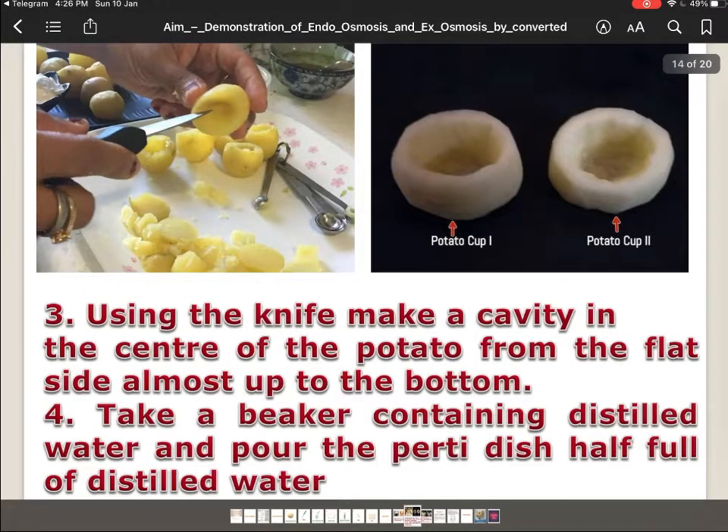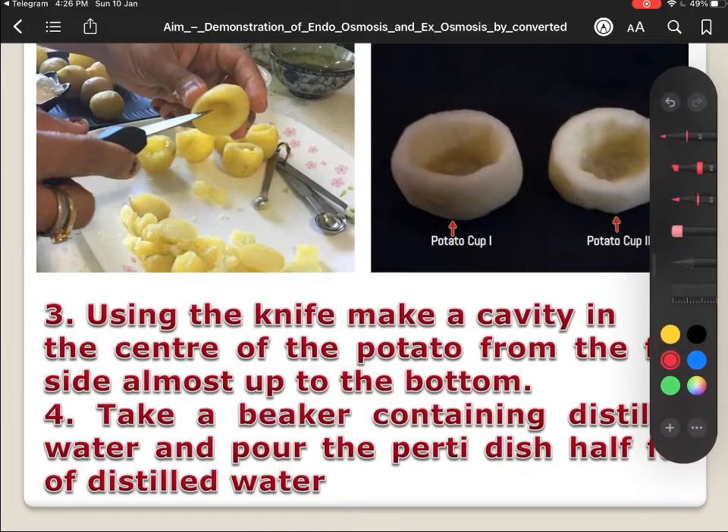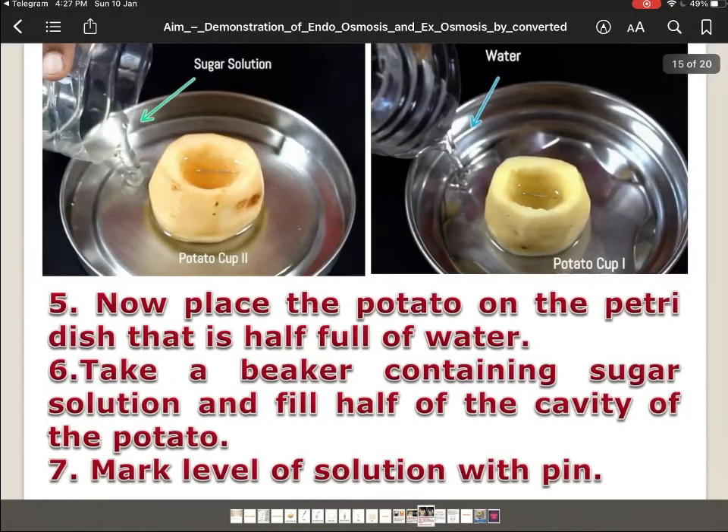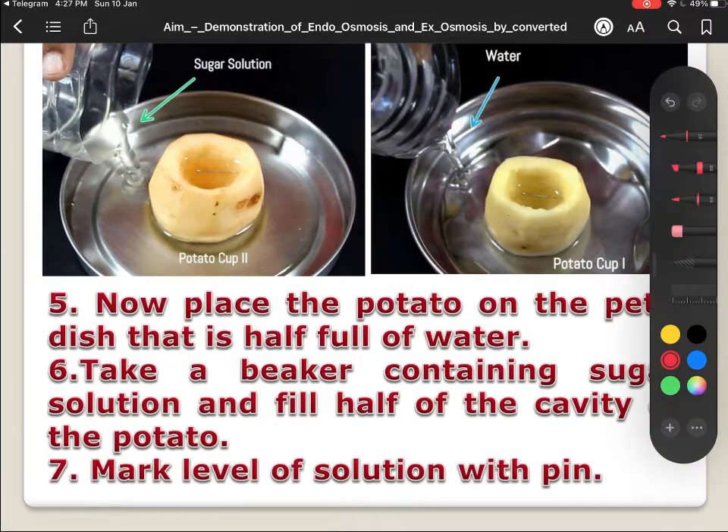We will have two potato cups — you can see here, this type of potato cups can be made using a large potato. Now we have to take a beaker containing distilled water, and this distilled water is to be poured in the petri dish. This type of arrangement is to be made.